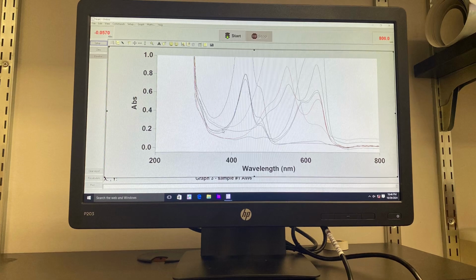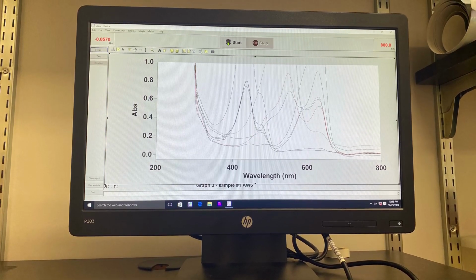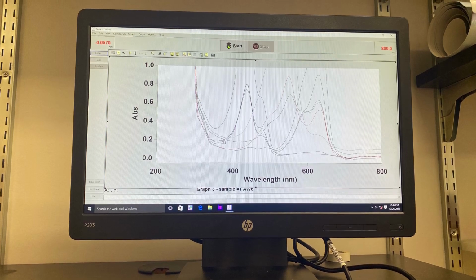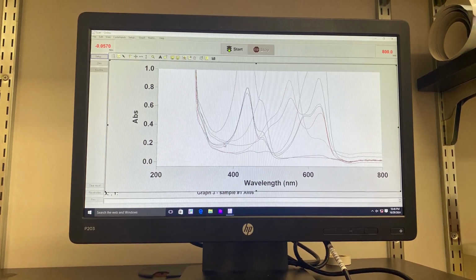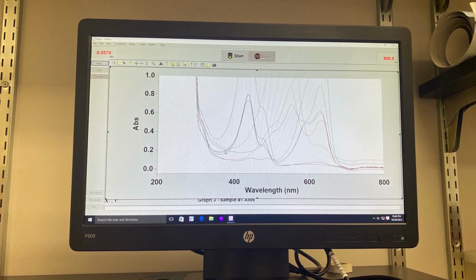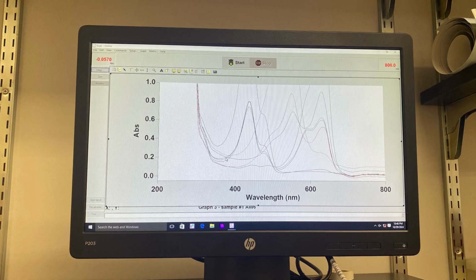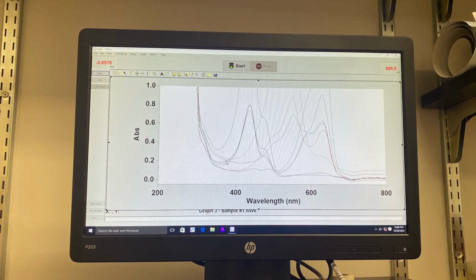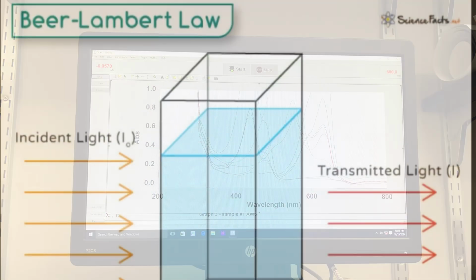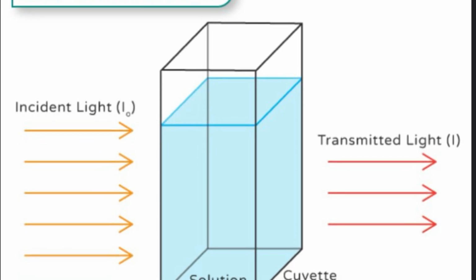The quantitative data focuses on measuring the substance present, while the qualitative data focuses on identifying what the substance present is. We quantitatively observe our wavelength, comparing it to known wavelengths in the lab. By doing so, we are able to qualitatively identify the substance. We also used the Beer-Lambert law to identify the different absorbances of the sample.